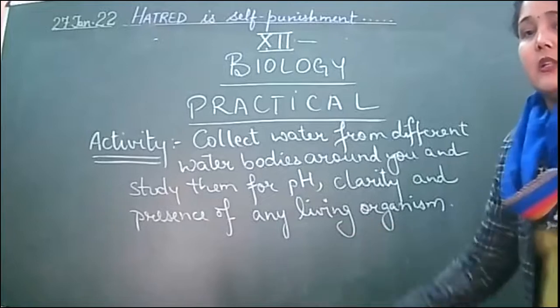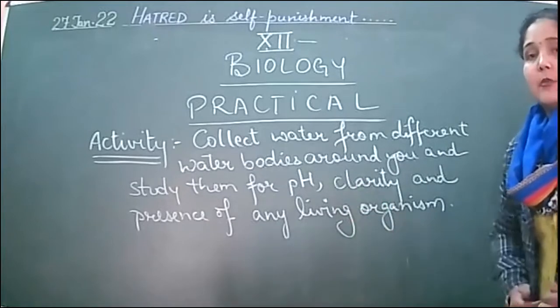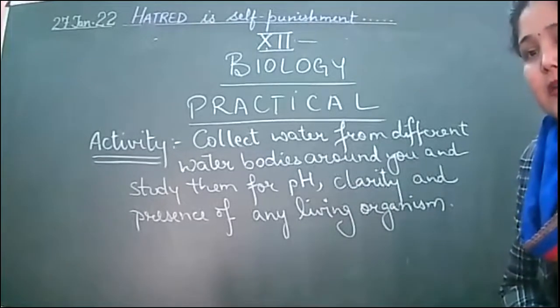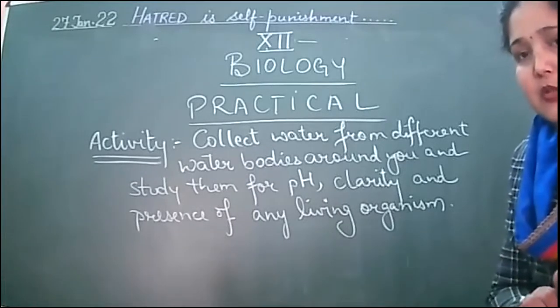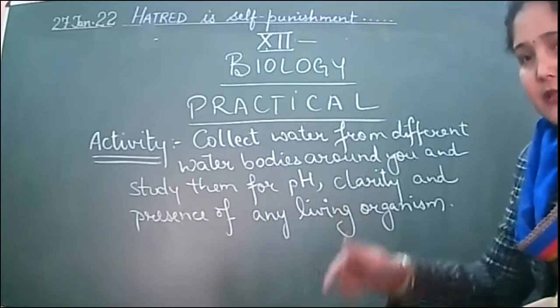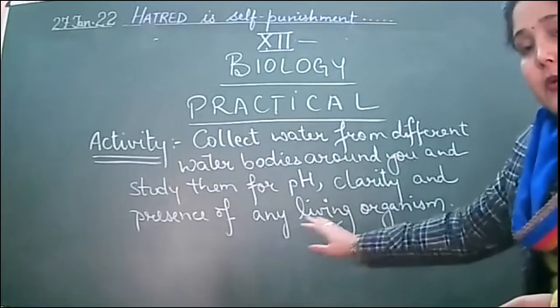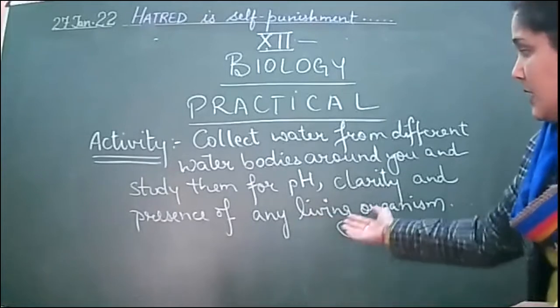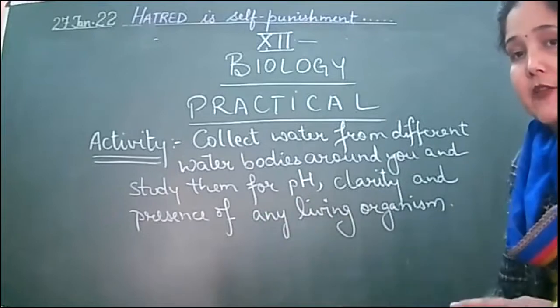Then presence of the living organisms. This requires a slide formation. I am telling you all this together because in the videos that are available, some things are different from what we are to perform here in the lab, right? You are to perform here in the lab. You are not to show video. You are not to follow any videos, right? You are to just perform when your exam will be there. Okay? So this presence of any living organism requires the slide formation.